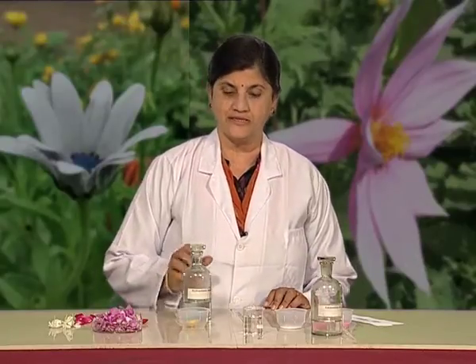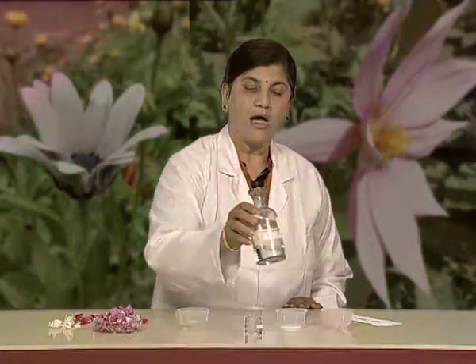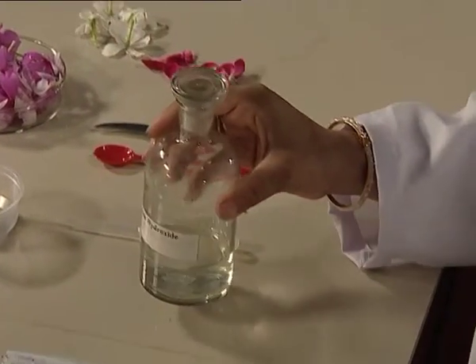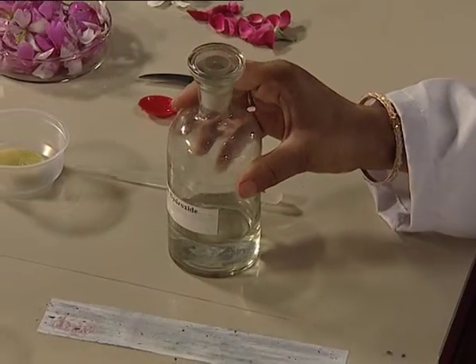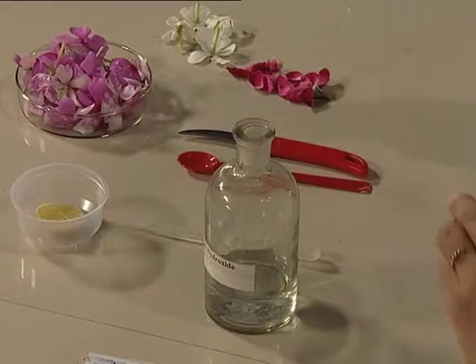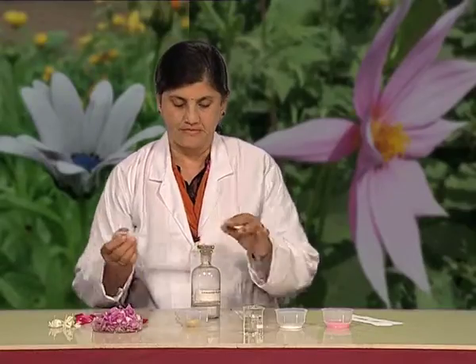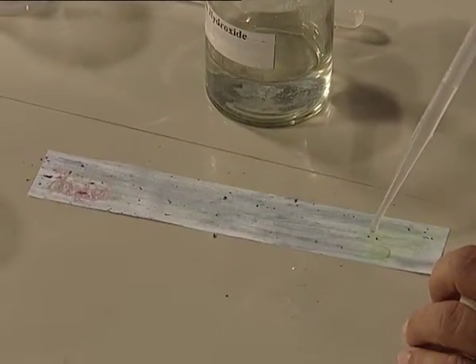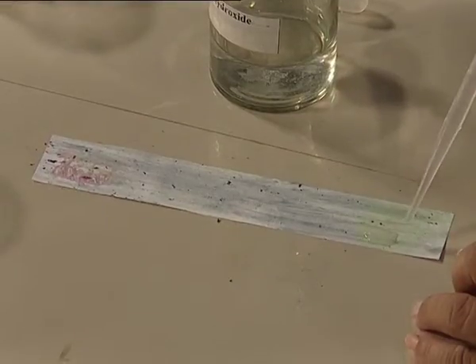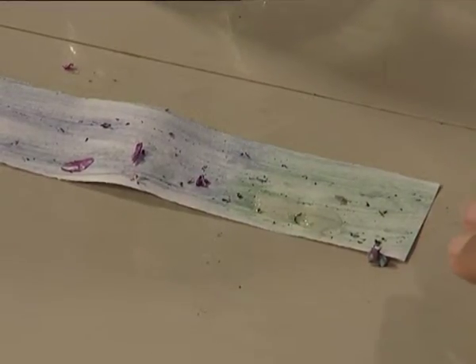Now let us test the same paper for a base called ammonium hydroxide. The same way, let us place the base here — take a dropper and take out the base. Now I am putting a drop of base on the Sada Bahar paper. Can you see the colour change? The colour is changing to green.